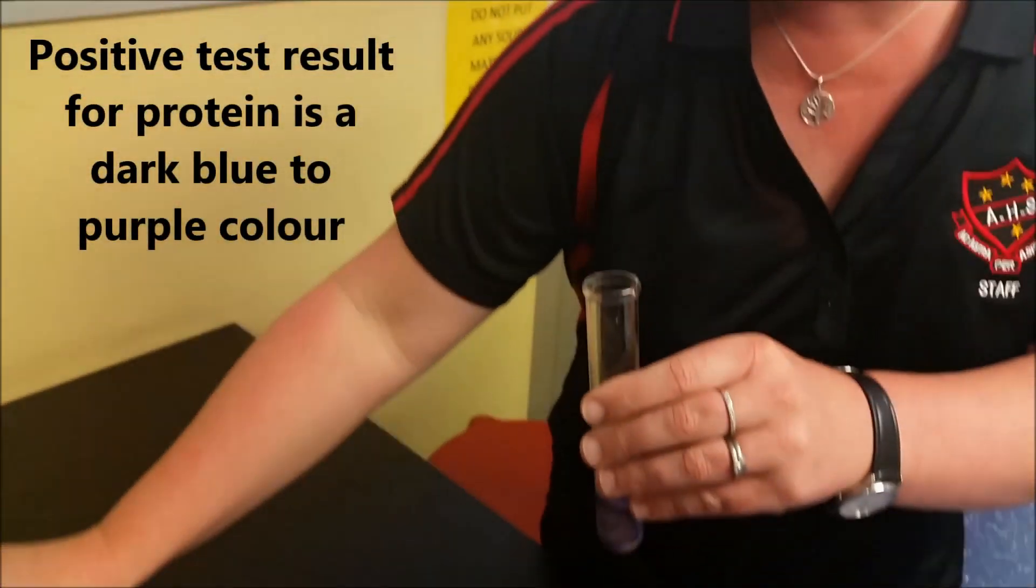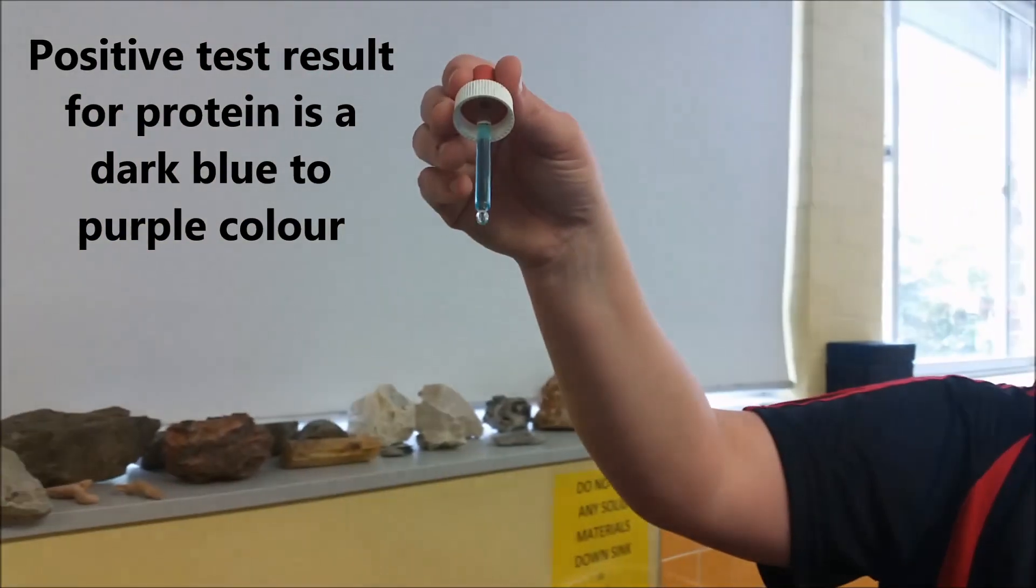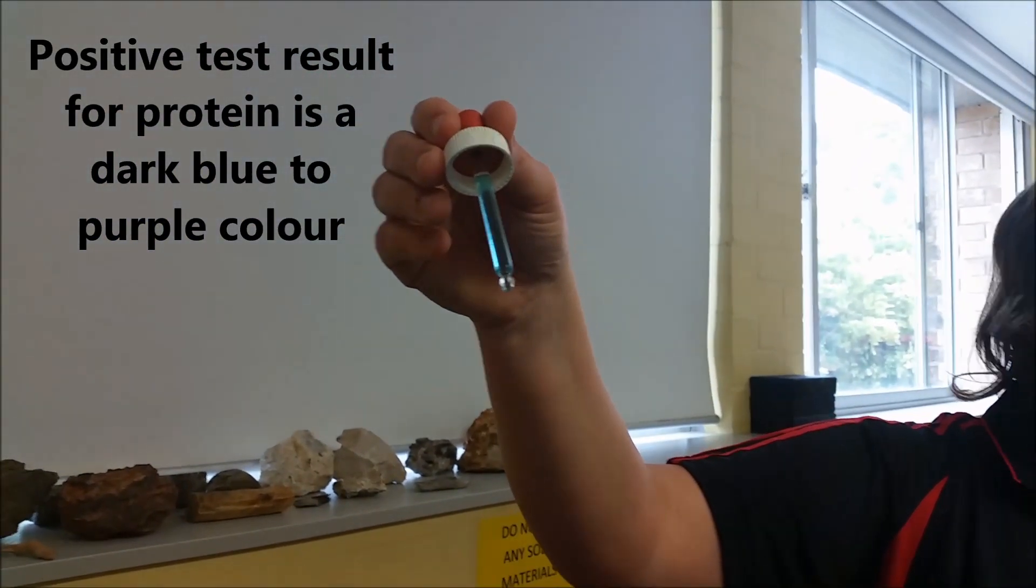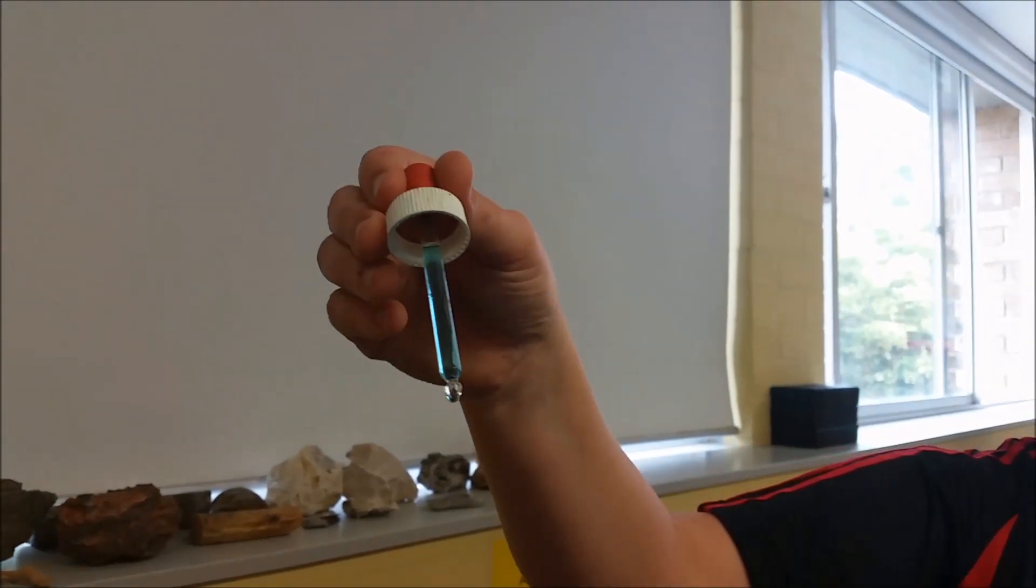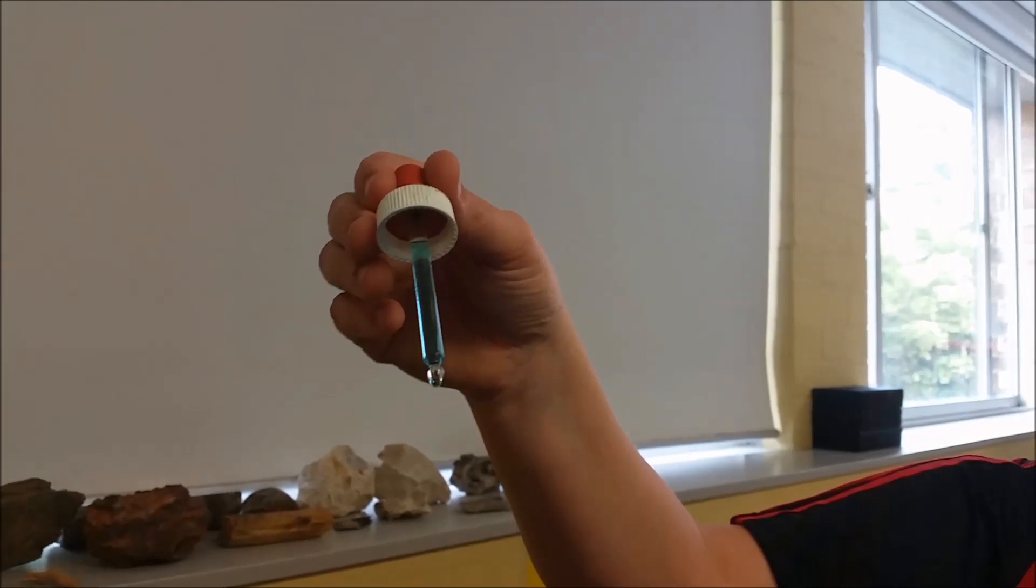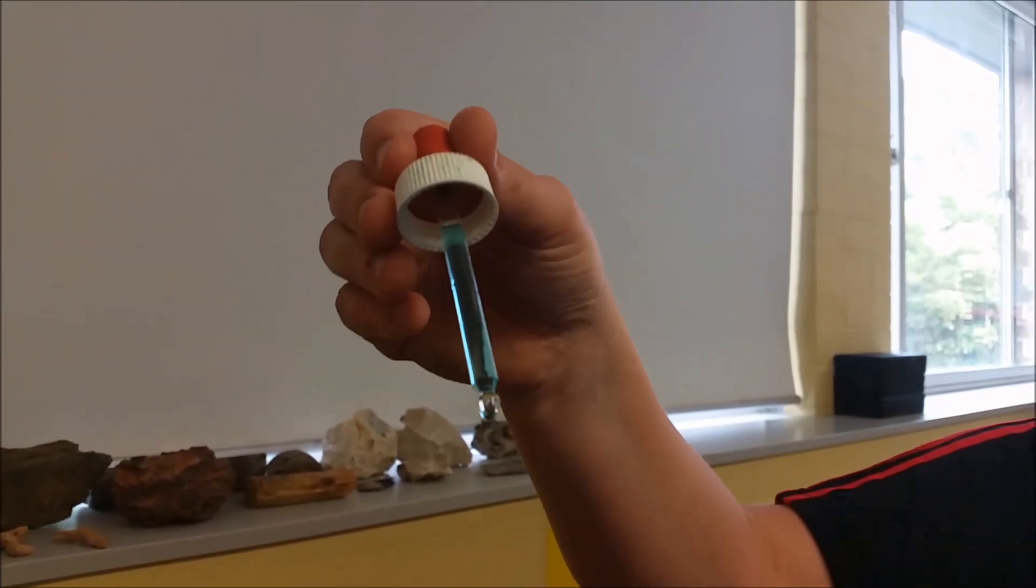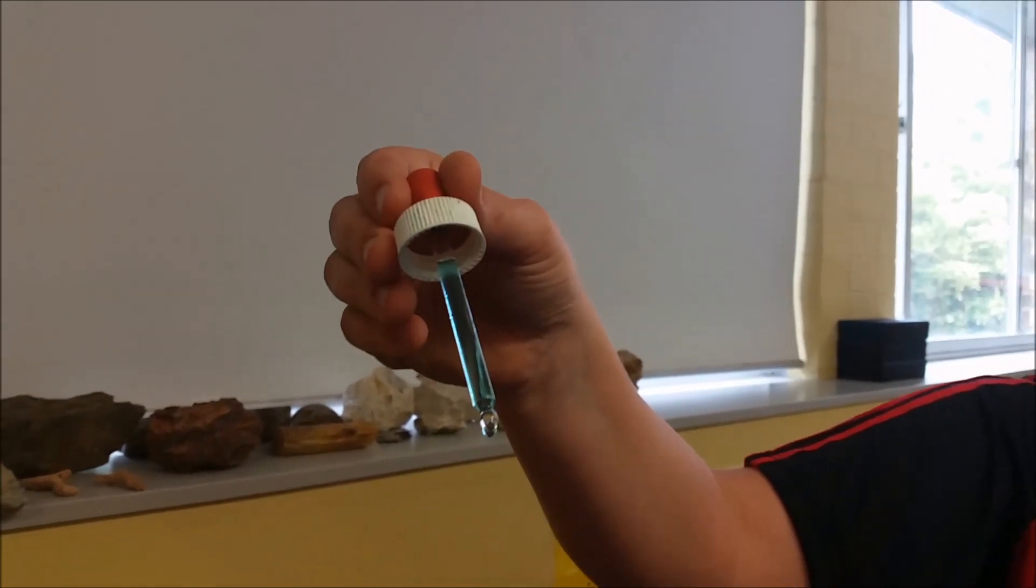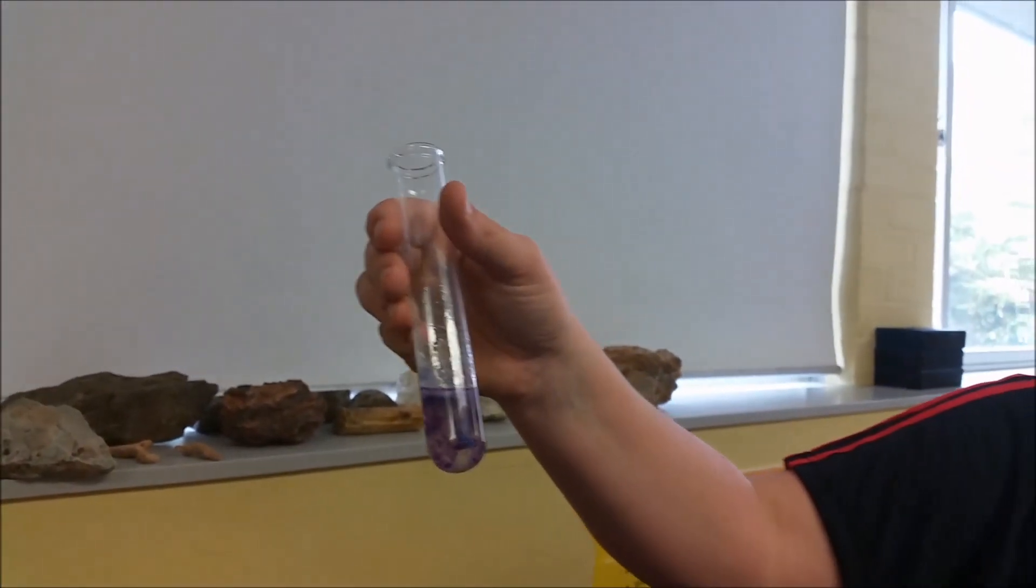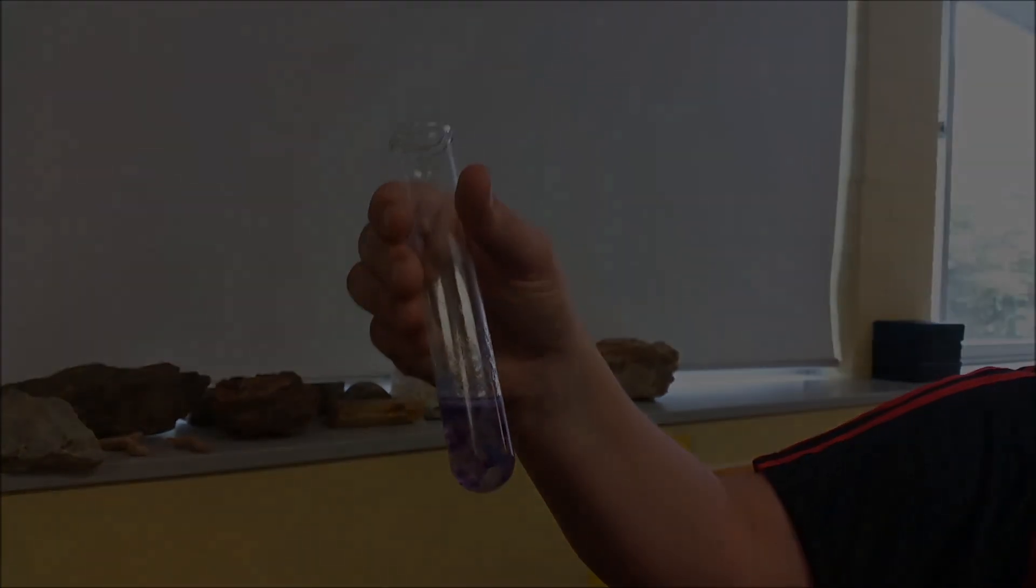I'll just show the copper sulphate again. Can everyone see the color of the copper sulphate? You guys have used that before. That with the copper sulphate, if it stays that sort of shade blue, it hasn't got protein. It can go a really deep shade of blue or the purple. So that blue, deep blue to a purple is the indicator of a positive test result for protein.